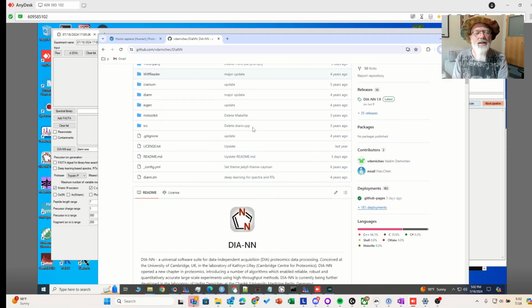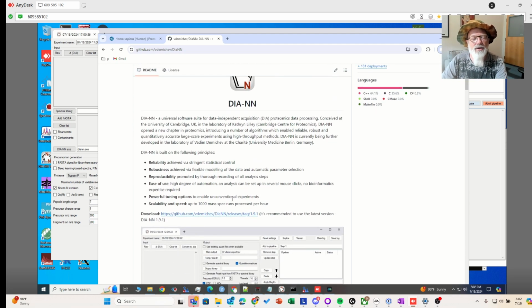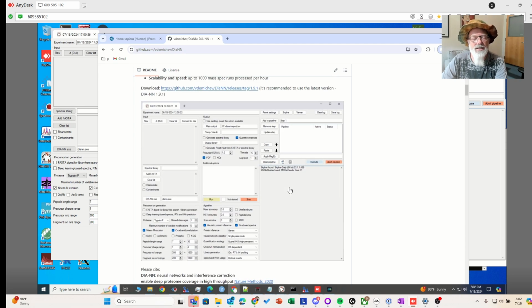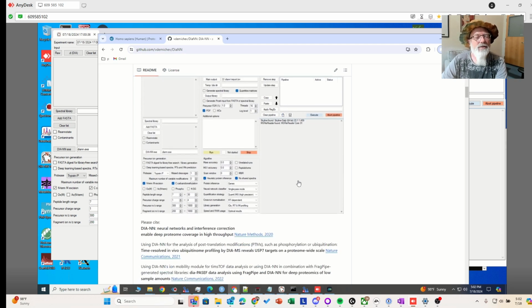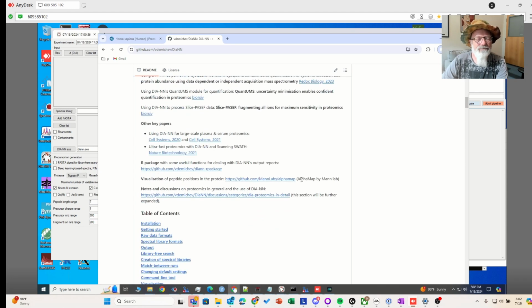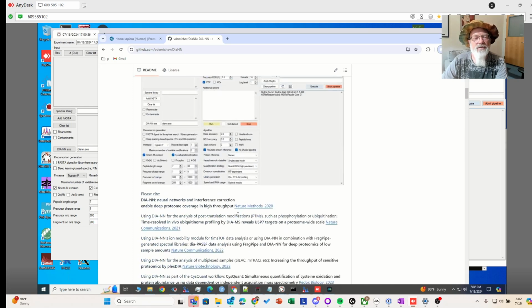For our last video of the series, we're going to look at the new version of DIA-NN. This seems to be one of my more popular videos for some reason, so you guys must really like it. A new, exciting version of DIA-NN just came out at ASMS about a month ago. It's 1.9.1, and it has some new exciting features like a data viewer, so it has Skyline and its own viewer built in. Super exciting, and maybe a little more sensitive or more accurate. I believe there's some information on what has changed in the new version.